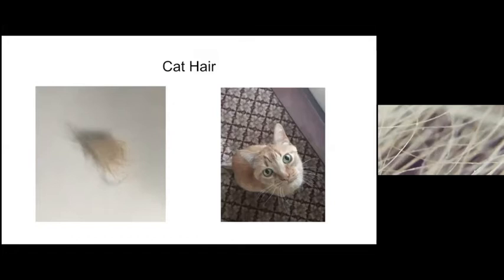So now that we see the macro image, what can you infer about the hair? What might the hair allow the animal to do, or provide for the animal? Could you make any inferences based on how the hair looked? Like I did with the mountain lion.